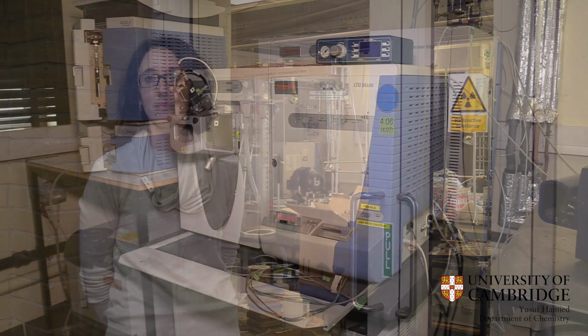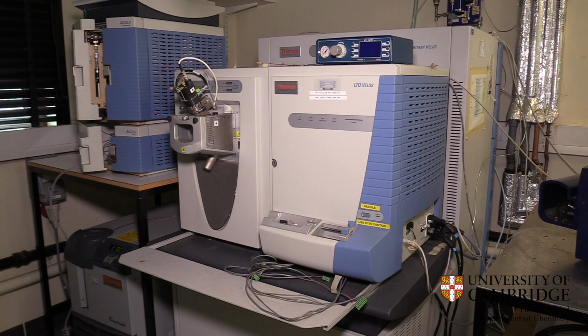We work using both field measurements and an experimental approach by doing laboratory measurements for understanding the impact on climate change of chemical transformation in aerosol particles in the atmosphere, and also the impact on human health by evaluating the toxicity of these particles. This is the mass spectrometry lab, and here you can see the Orbitrap.